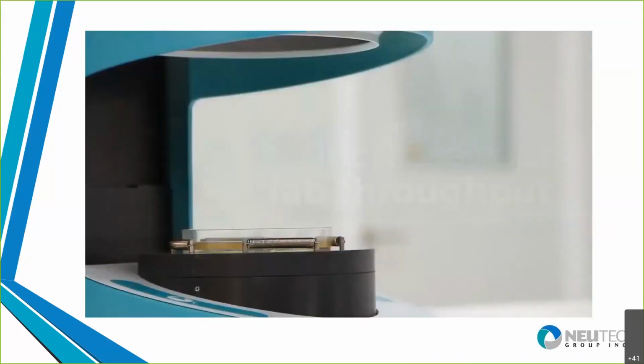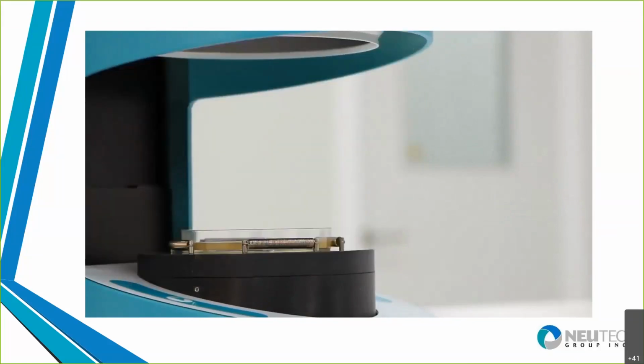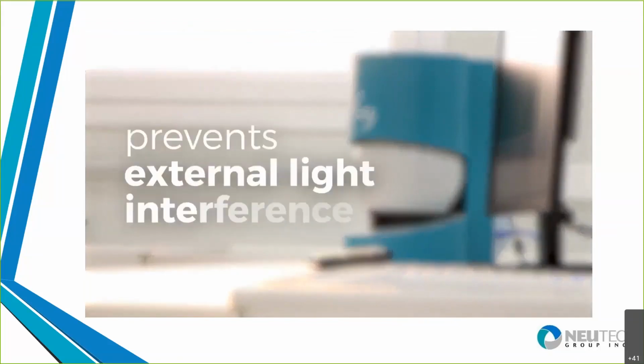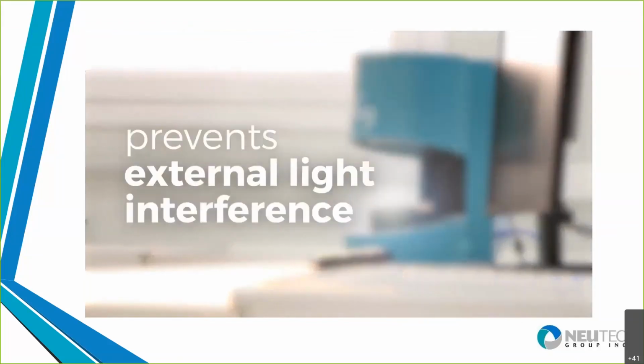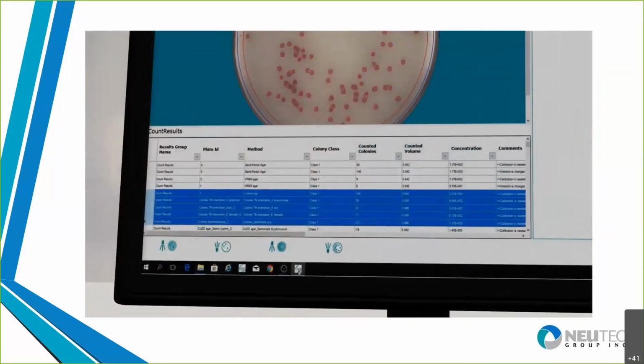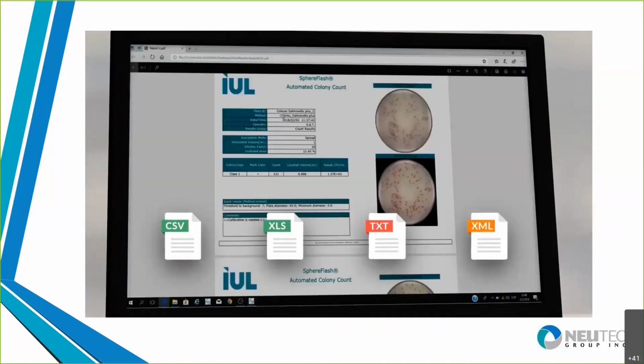If everything else weren't automated, this one really needs to be automated just to eliminate the mistakes that can cause hours and hours of work to be lost when this step and this colony counting isn't done correctly. So a really critical tool for any kind of microbial testing laboratory.